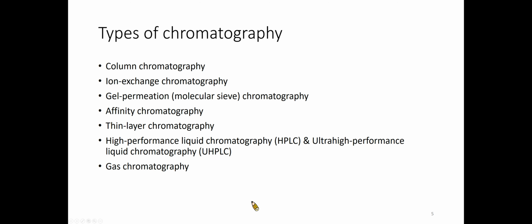There are many different kinds of chromatography, from column chromatography, ion exchange chromatography, gel permeation chromatography, affinity chromatography, thin layer chromatography, HPLC and UPLC, and gas chromatography. We will go through these techniques in the following slides.